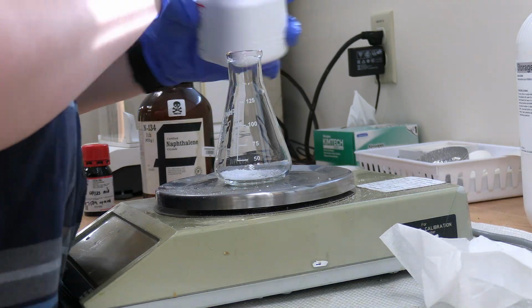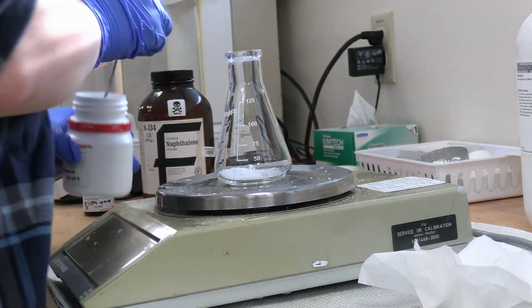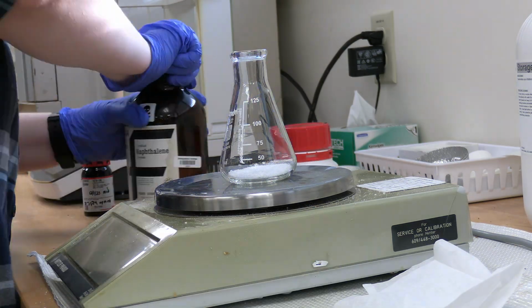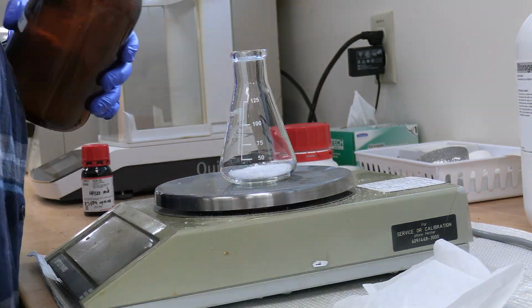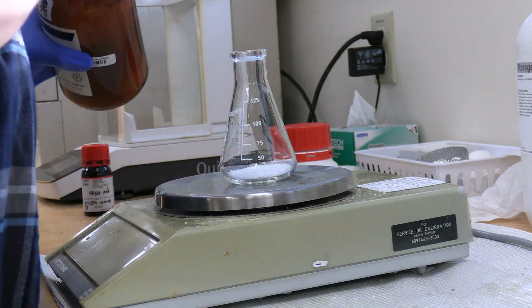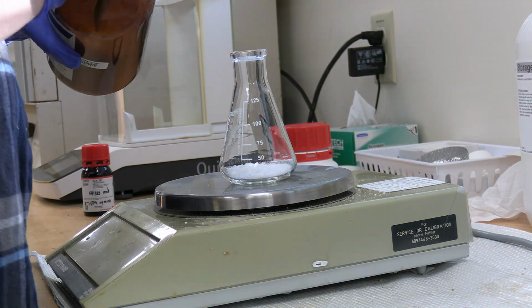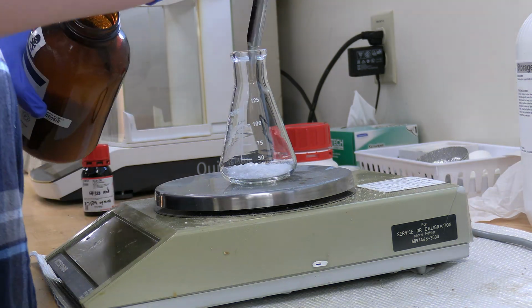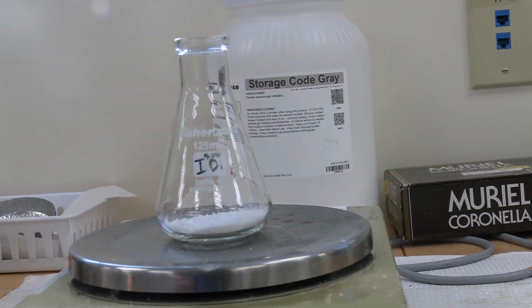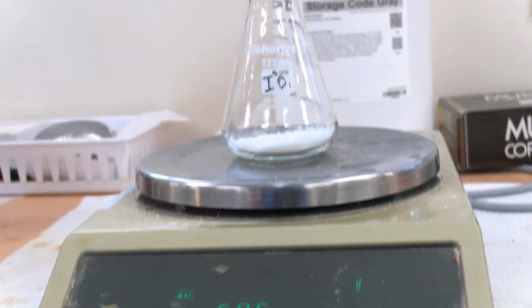When adding products into a container on a scale, make sure that you're using a spatula that is the right size for your product. If you spill anything, like I do a couple times here, just make sure to take a chem wipe and clean off the scale and your surroundings. Make sure to wear gloves when you do this, as you don't really want to touch anything with your bare hands. When you're done using a container with your product, close it up and put it back in the cabinet where you found it. Now that I've added all 3 of my products, the total weight of everything I weighed out is 6.05 grams, which is a little over, but that is perfectly okay.